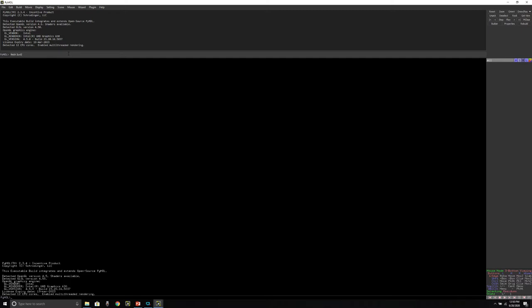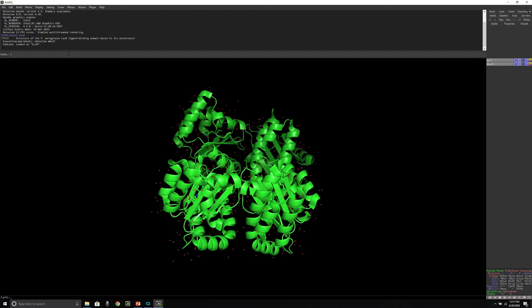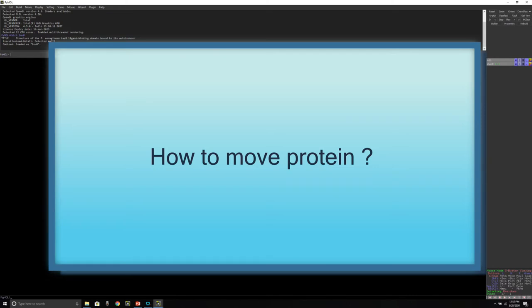What you're now seeing is the crystal structure — the three-dimensional structure of the protein for that four-letter code. This is very convenient as you can directly import the structure without visiting the website. However, if you don't know the code, you'll need to visit the Protein Data Bank website to look it up and then use the PyMOL command line to import it.